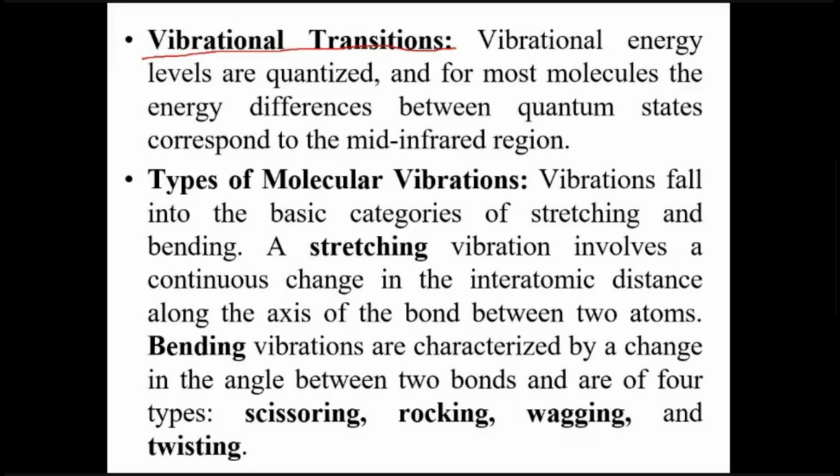See, what happens is initially the molecule is in one vibrational state. After absorbing the energy, it will go to a higher energy level only by vibrating more. Yes, Pooja Jaiswal. It occurs between different vibrational states. Very good. Pooja is absolutely right. So instead of changing the electronic state, we are changing the vibrational state.